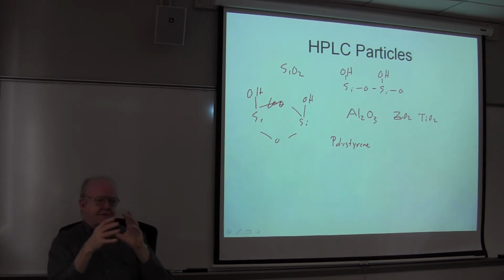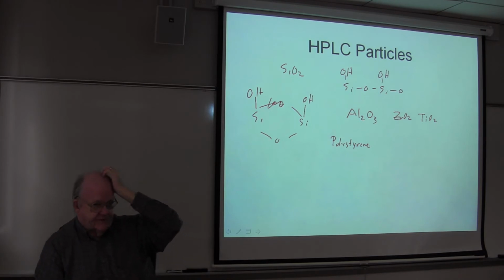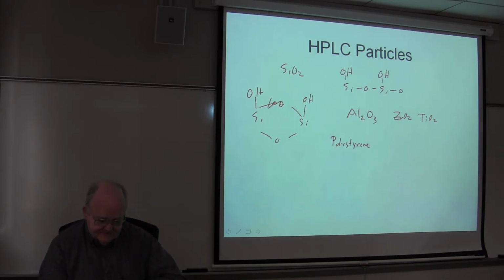They're sort of like, you know, watermelon. You squeeze it and the water comes out. They can't take much in the way of pressure. The beauty of these biopolymers is they're compatible with biomolecules. They don't denature. But that's not HPLC, that's LC. But that's still LC, and we're going to talk about it.